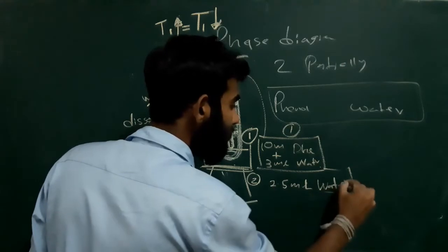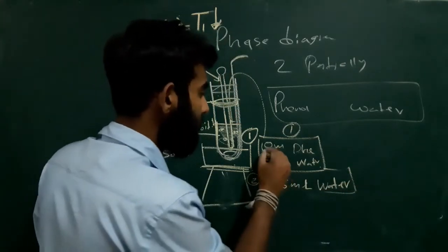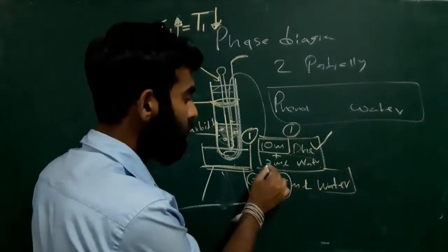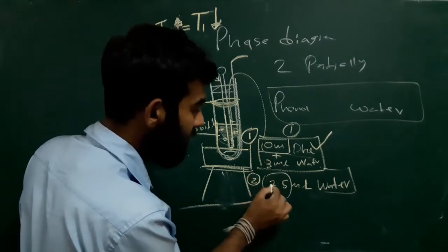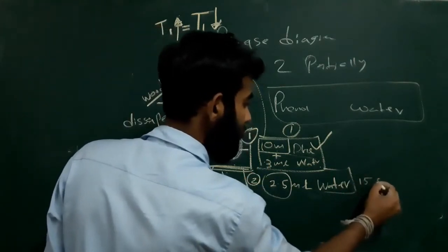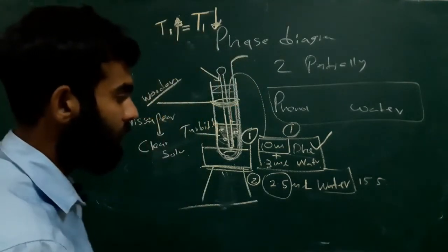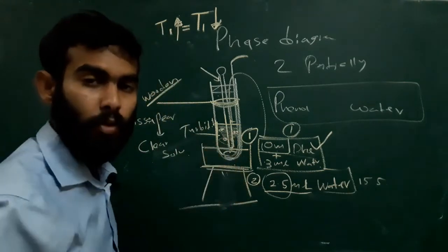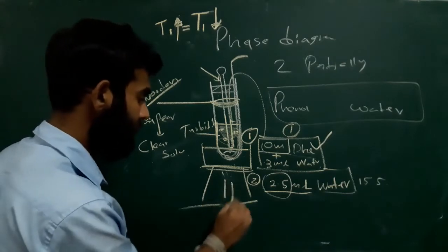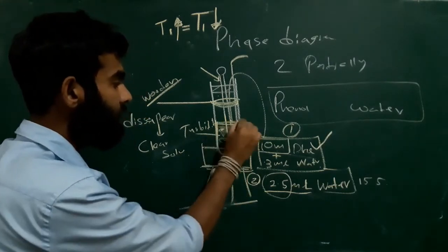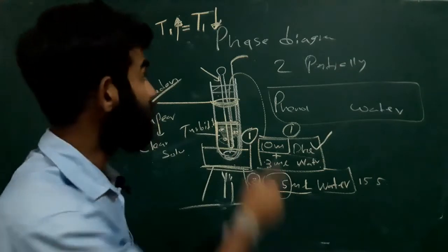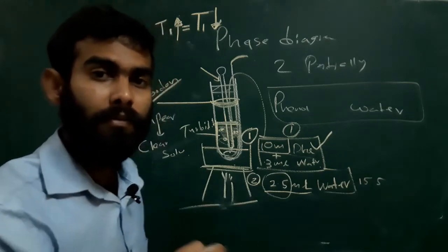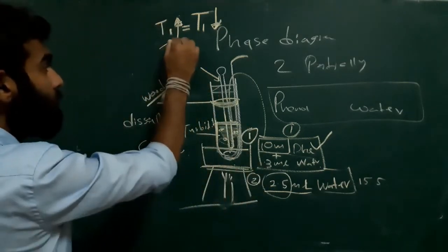Now we are increasing the water amount. The phenol volume remains constant at 10 ml, and we add another 2.5 ml of water, making the total volume 12.5 ml. We will heat this solution again using the water bath. At a certain temperature — not T1 but another temperature — the turbidity will disappear and we will see a clear solution. We will record that temperature as T2.